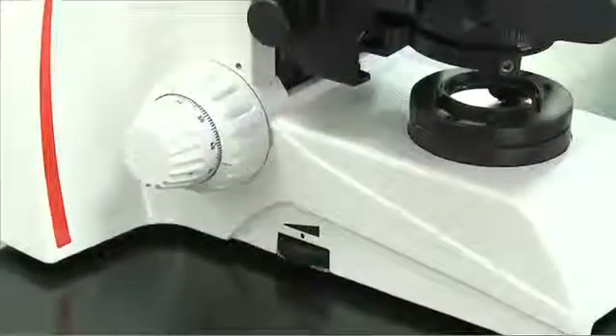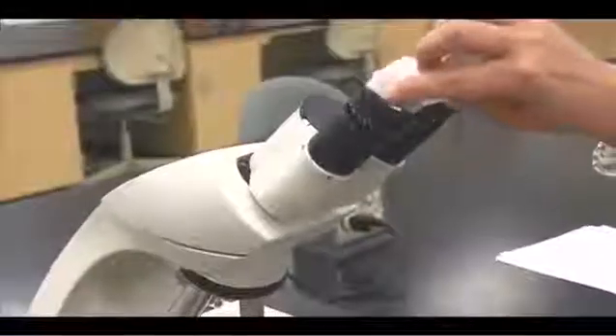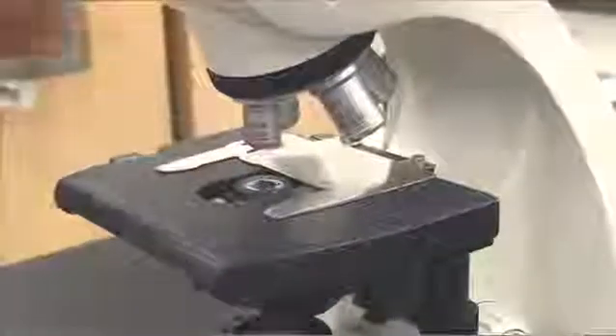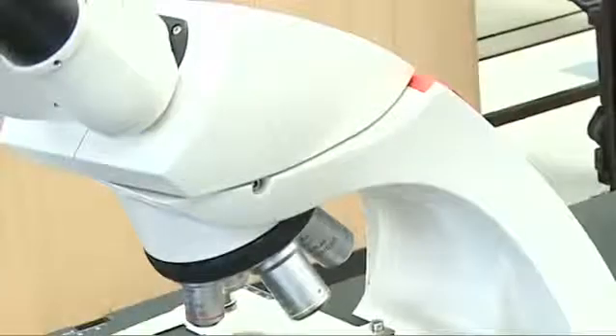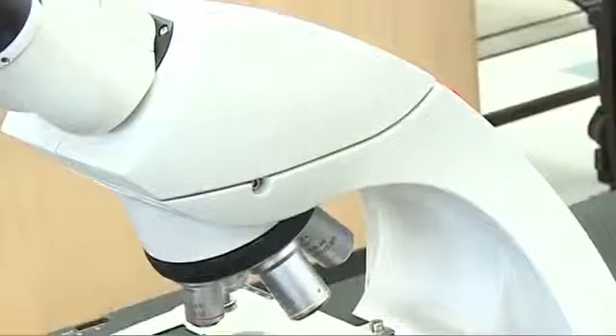Lower the rheostat and turn off the power. Clean all of the lenses with lens paper. Make sure that the condenser is even with the mechanical stage. Make sure that the microscope head is aligned with the body of the scope.